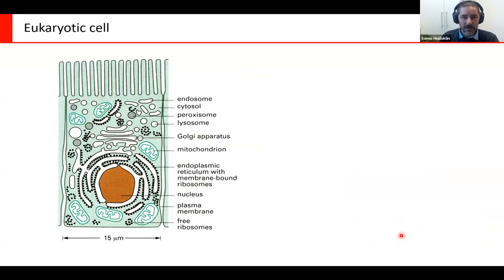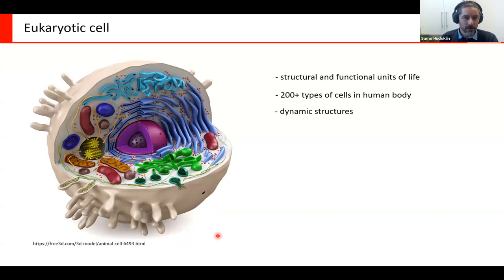Of course, anyone who has ever looked at a cell in more detail in the microscope knows that cells are not as simple as is frequently proposed in the textbooks. First of all, cells are three-dimensional objects and very dynamic, though they contain similar organelles.